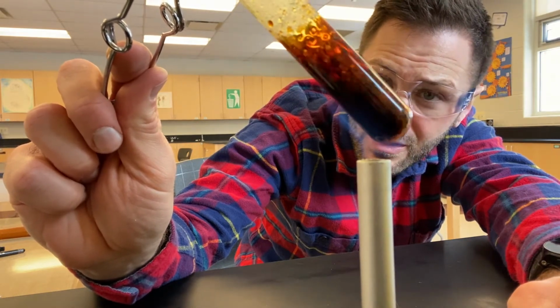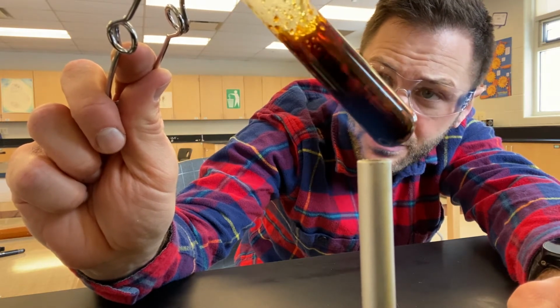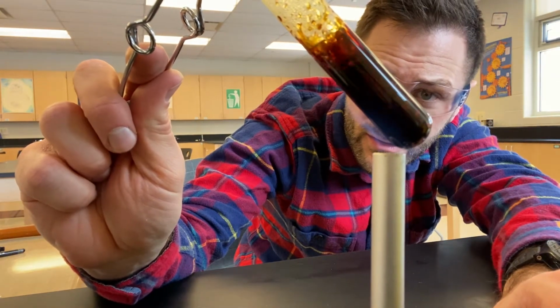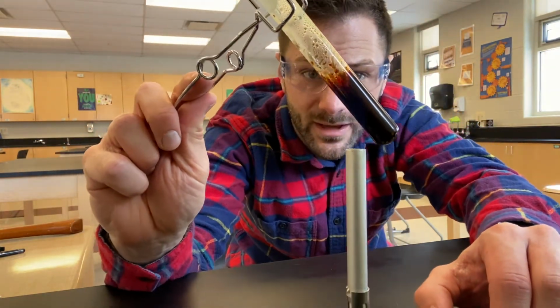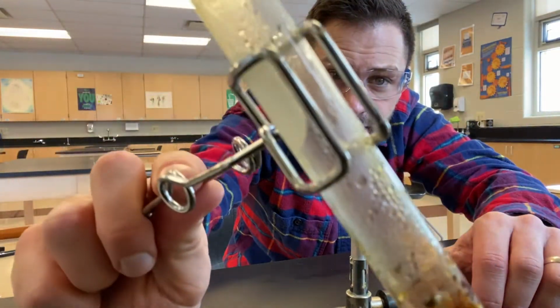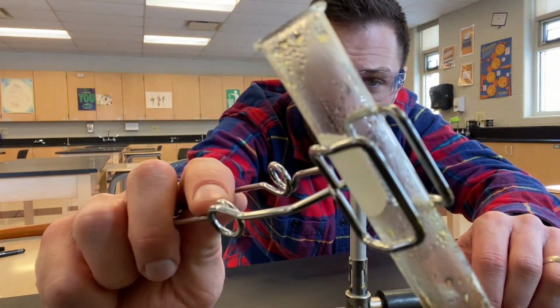Hearing a lot of gurgling in there. Gases are being produced, and there are a lot of bubbles down here. I've got no white left, no light brown. It's all become a very dark brown. I wouldn't call it black just yet. Let's look at the test tube here. I'll bring it away from the flame for a minute. You can see it's bubbling, and I can see condensation, some sort of liquid forming droplets on the test tube.